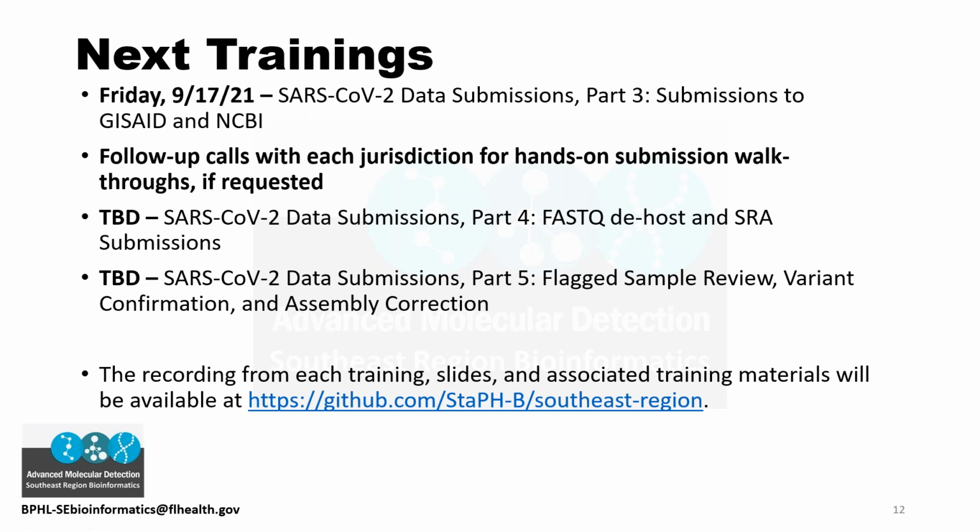And if you would like to schedule a call with me to do this hands-on yourself with your own data, just to make sure that everything works properly with your files. I tried to include the feedback I've already received from which pipelines are being used in our region by the different jurisdictions, different labs. I tried to write the scripts to work with all those different formats, because people are using different things.